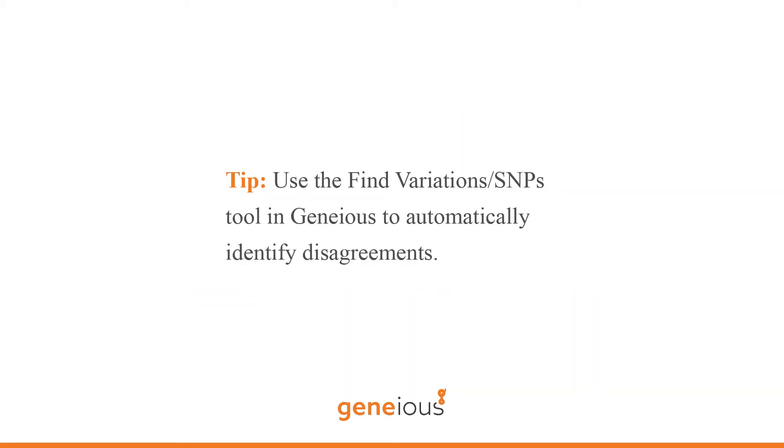The Find Variations and Snips tool in Genius can be used to automatically identify disagreements and can be run on multiple contigs at once.